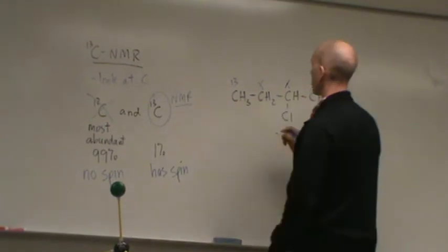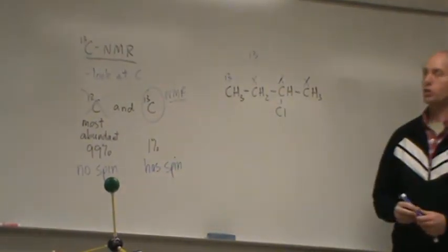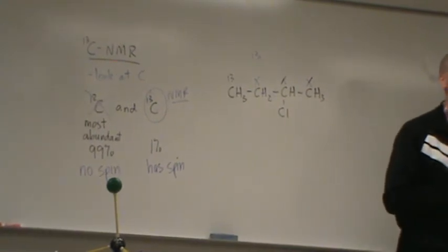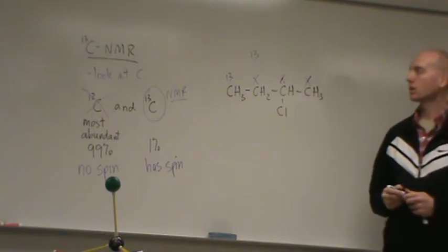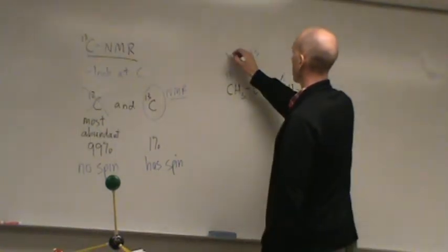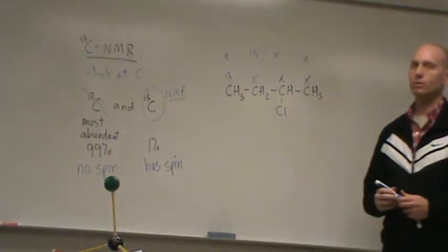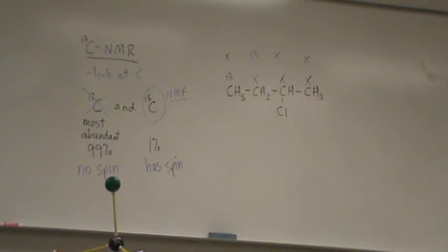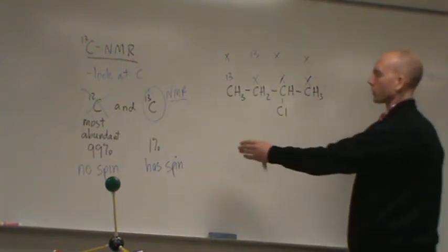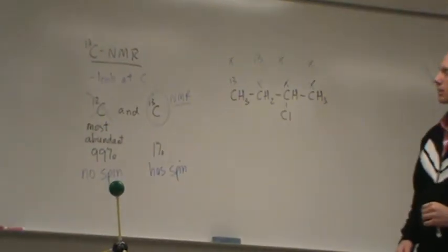What about if I found another molecule where that CH2 was a C13? What might you say about the others? That they probably would not be C13 either, because of the low probability. So this abundance is coming into play up here.